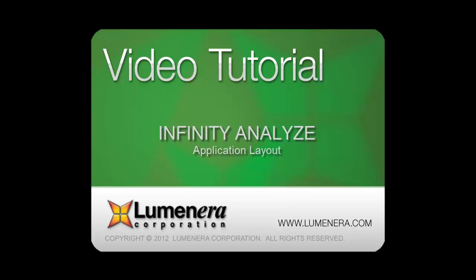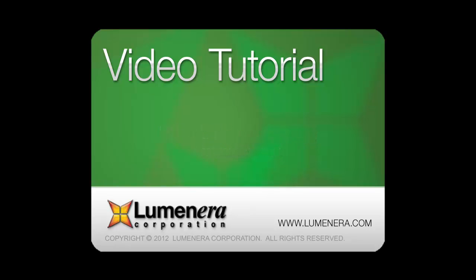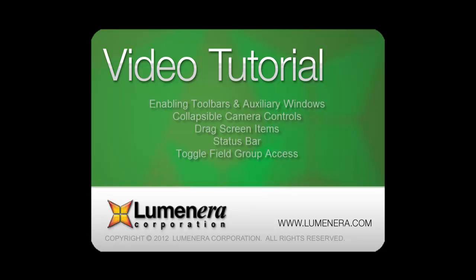This instructional video will outline the options available to configure the Infinity Analyze application layout to suit your preference. This is another video tutorial in the Infinity Analyze series. In this installment, we'll take a look at the following topics.